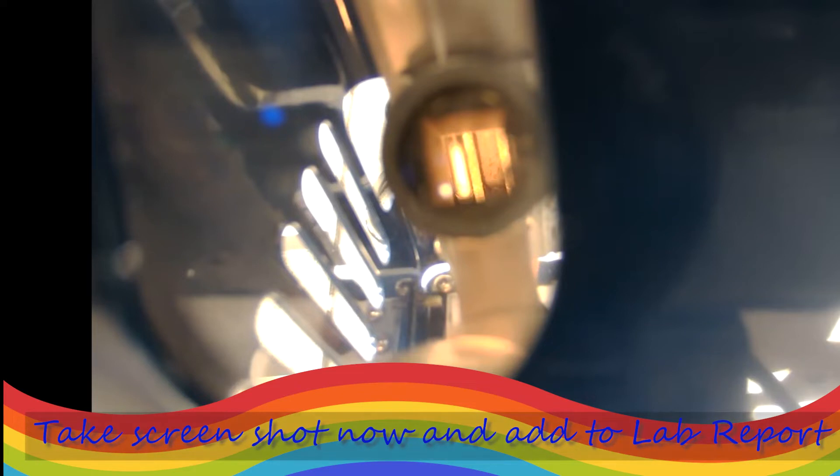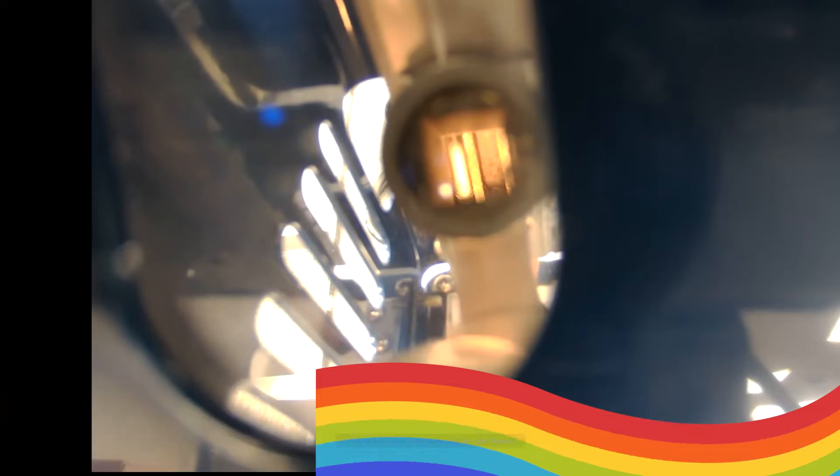We cannot heat up the sample too fast. It has to go slowly because it takes time for thermometer to show the actual temperature. Now we are still in the process of melting our unknown number one, but this is the real sample.